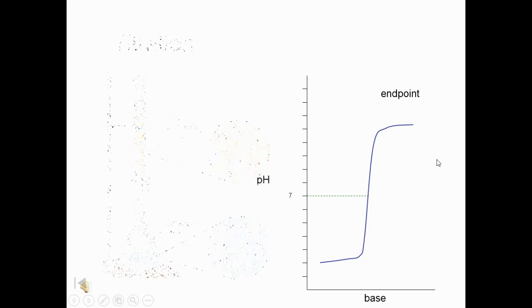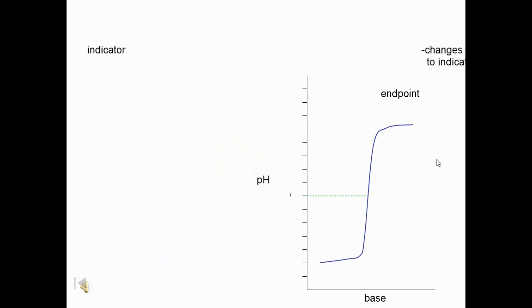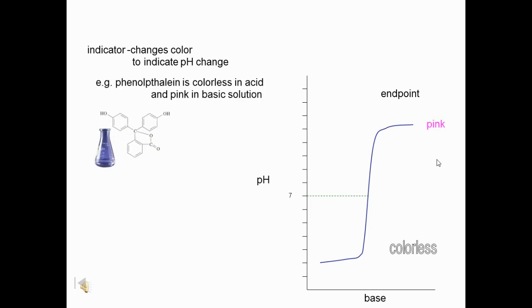So if we're looking at this graph here, the pH indicator then is going to change color to indicate a rapid pH change. So phenolphthalein is colorless when it's in an acid and turns pink in a base. So for this example, looking at it, pH 7 might be a nice endpoint.